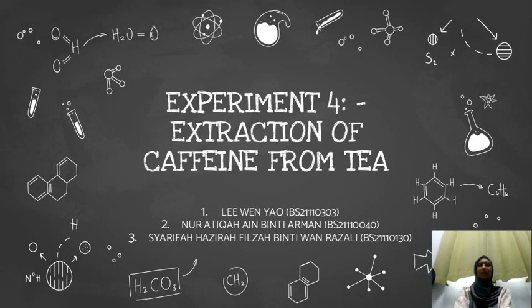Hello everyone, this video is about experiment 4, the title of which is extraction of caffeine from tea.